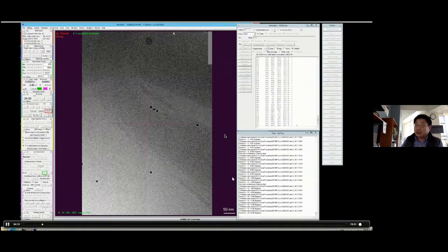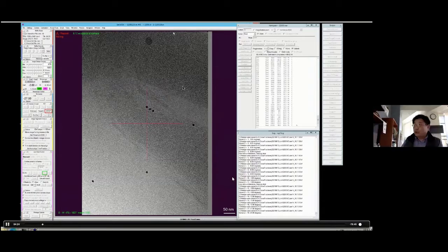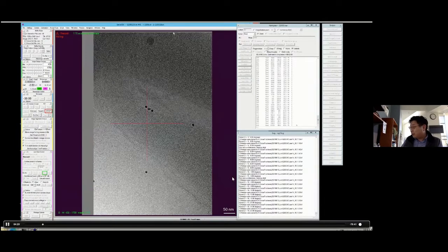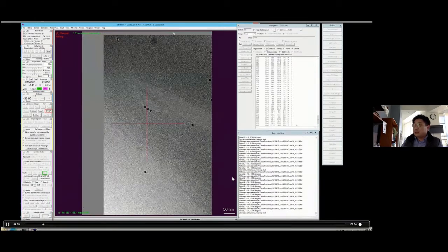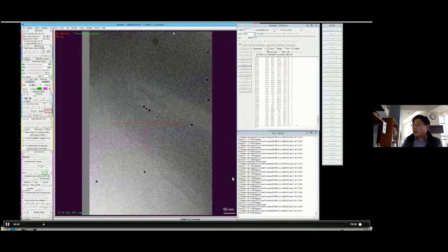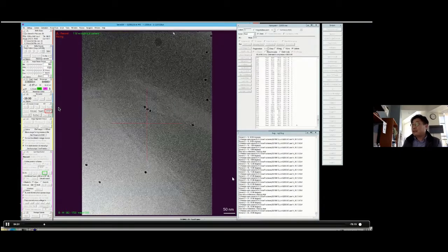The idea is this will continue to collect to -48 degree, to continue the imaging. You can see that everything is saved. The data was saved a couple of days ago, and this will continue until they finish. When the jump is too big, they retake the picture, based on how much shift there is. And so now you can see typically it's about 6 to 7 minutes to collect these 2 series.